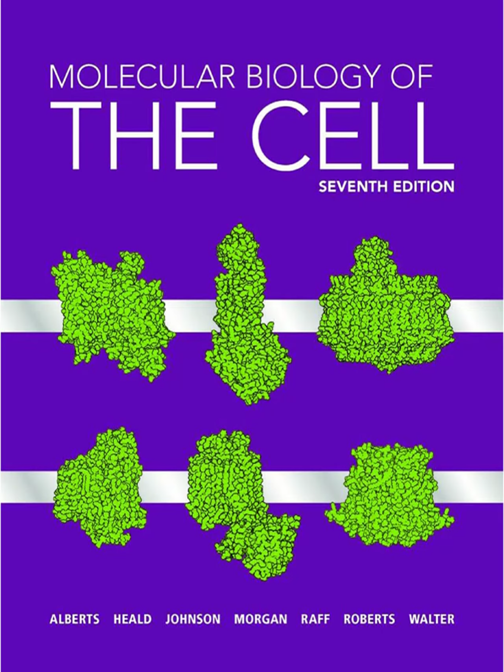What's the optical approach? That's confocal microscopy. It tackles the blur problem before the light hits the detector. How?